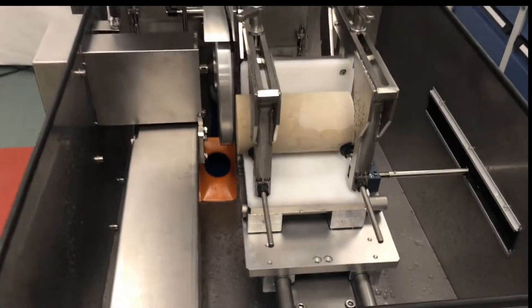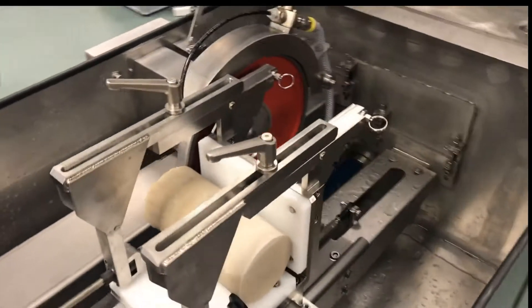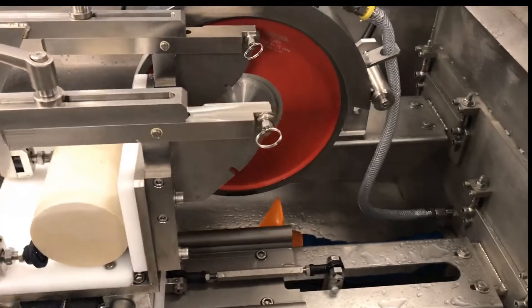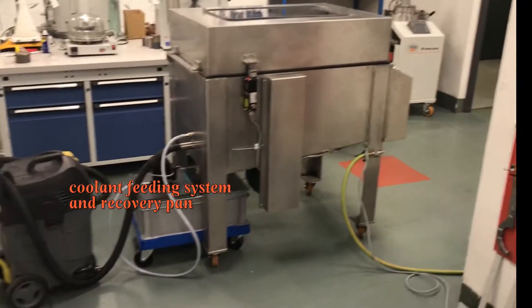The device comprises a specimen clamping device, a hydraulically operated feed mechanism, a diamond grinding cap wheel, a coolant feeding system and recovery pan.